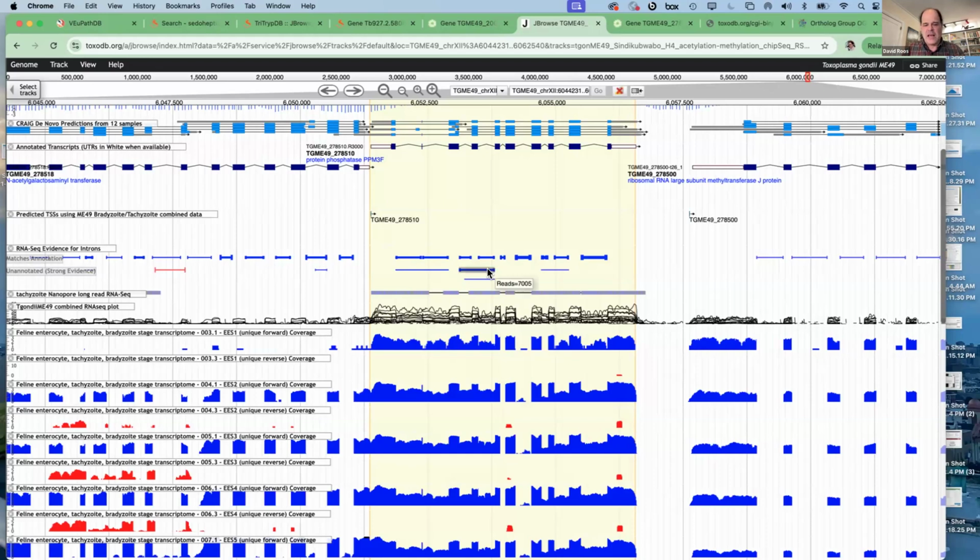But the fact that half of all transcripts lose this exon suggests to me that that should probably be annotated here. Again, this is a judgment call. It's likely to be non-functional, but of course there are many reasons why a non-functional protein, a non-functional enzyme, protein phosphatase here, could still be a functional transcript that leads to, for example, a dominant negative regulator in a multi-subunit protein.